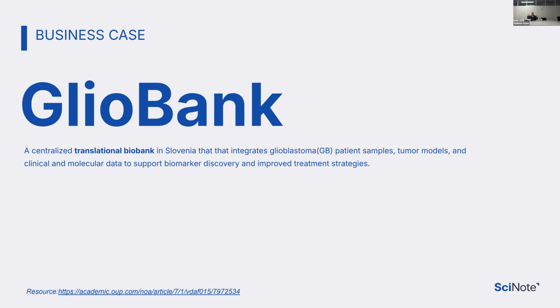So you can already see that, first of all, a biobank has many samples and has a lot of issues with compliance, and I'm going to talk more about this in a few slides. But I'm sure you can already imagine that this can be a very tricky use case to set up with inventory.